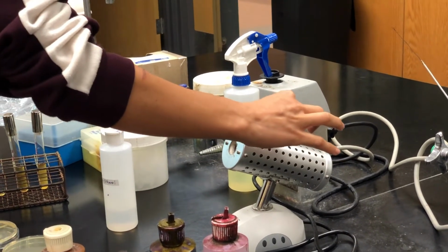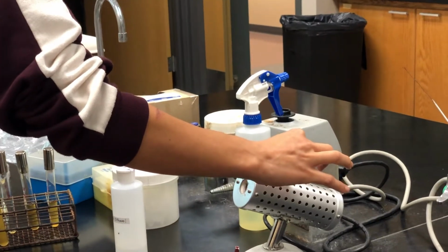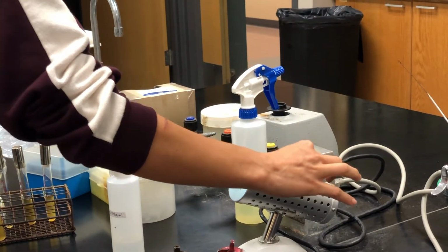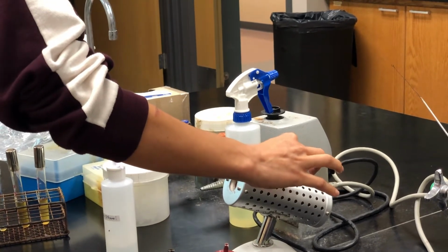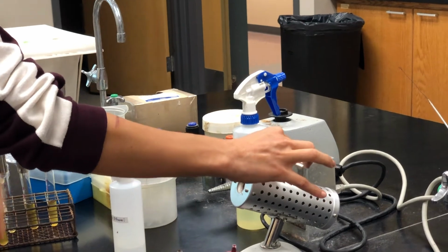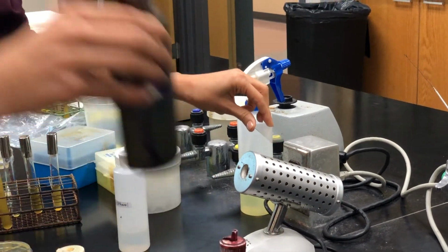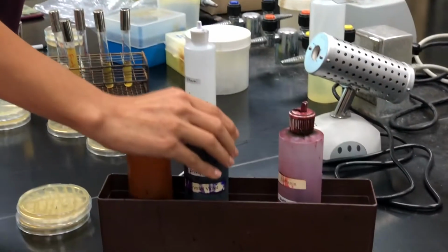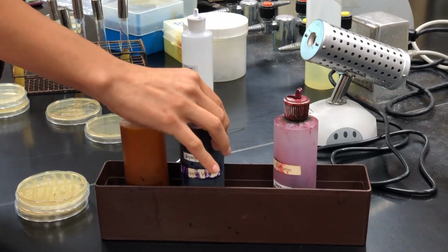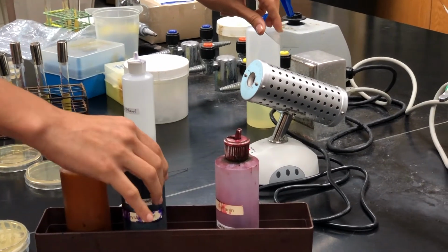And after that, we need to stain the smear with crystal violet for 1 minute and then rinse it with water. Then, so here is the crystal violet. This is the crystal violet. We need to stain it with crystal violet for 1 minute. And then we need to rinse it with water.